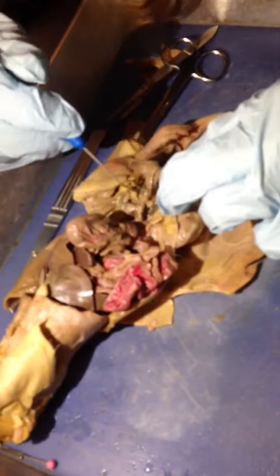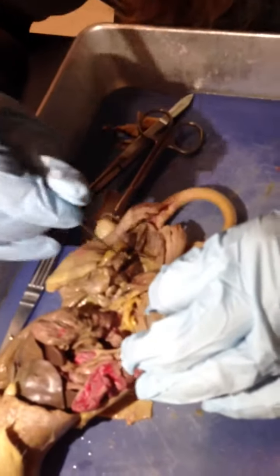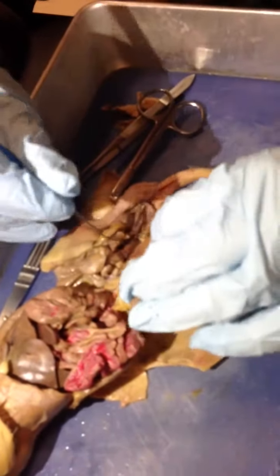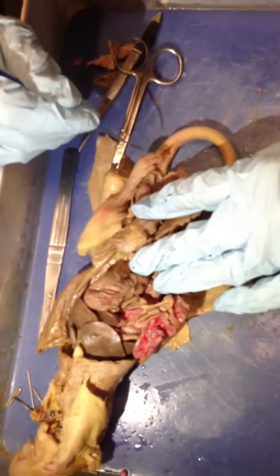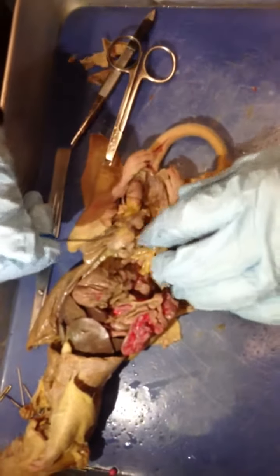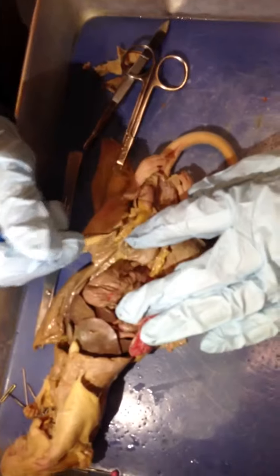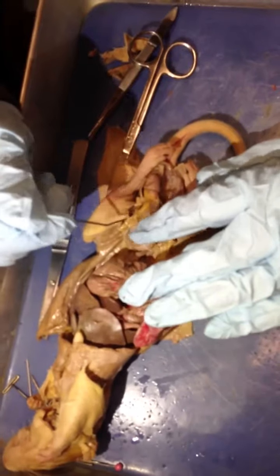Okay, and then your lovely penis right here, this whole thing. And then, okay. So the scrotum is what contains it, and then your cremasteric pouch is this kind of layer of skin, and we call the cavity inside the cremasteric pouch the vaginal cavity. Yes, guys have vaginal cavities. And the opening to the vaginal cavity, what you cut through to get to this pouch, that's your inguinal canal. Okay?